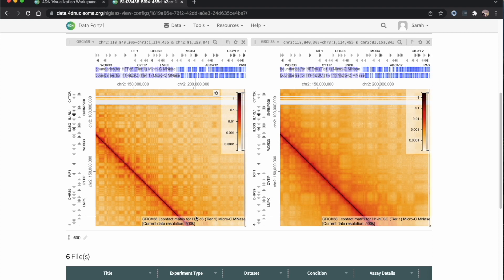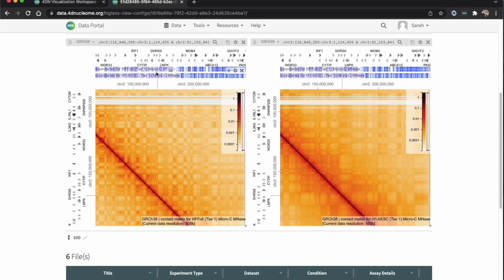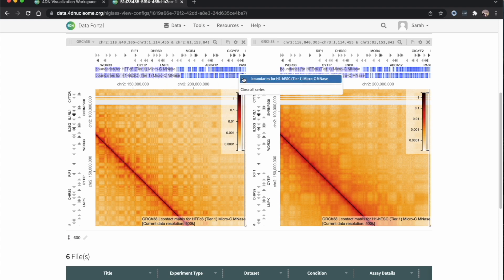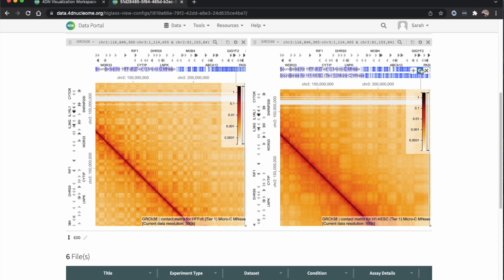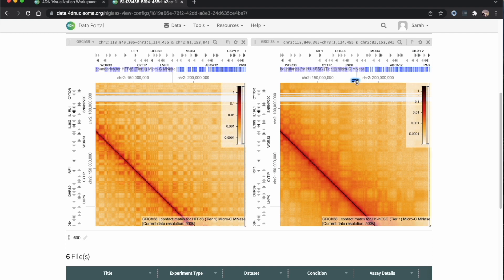Perhaps for the 1D tracks, we only want to compare HFF to HFF. So I can mouse over the H1 1D track and remove it from the left-hand side, and the same on the right for H1. I'll mouse over the HFF 1D track and remove that from the right-hand side.